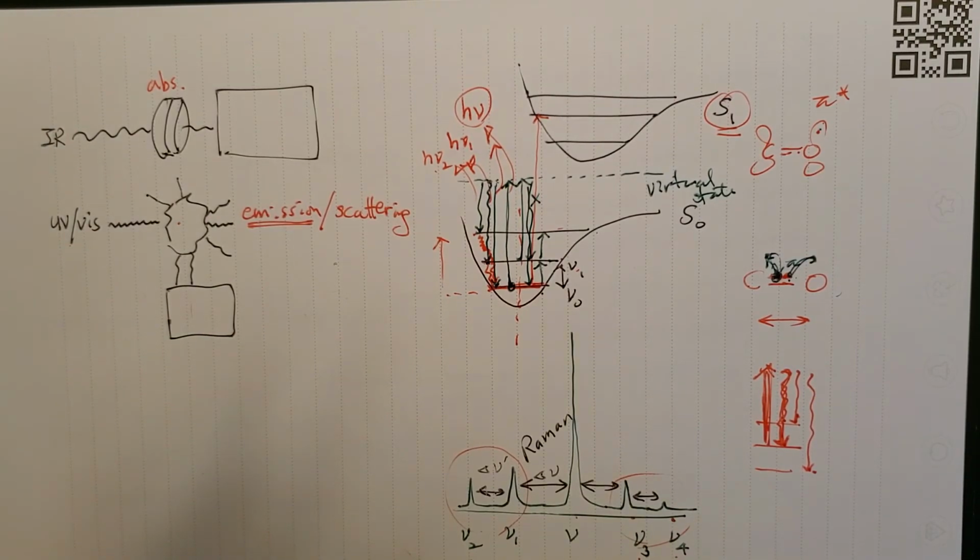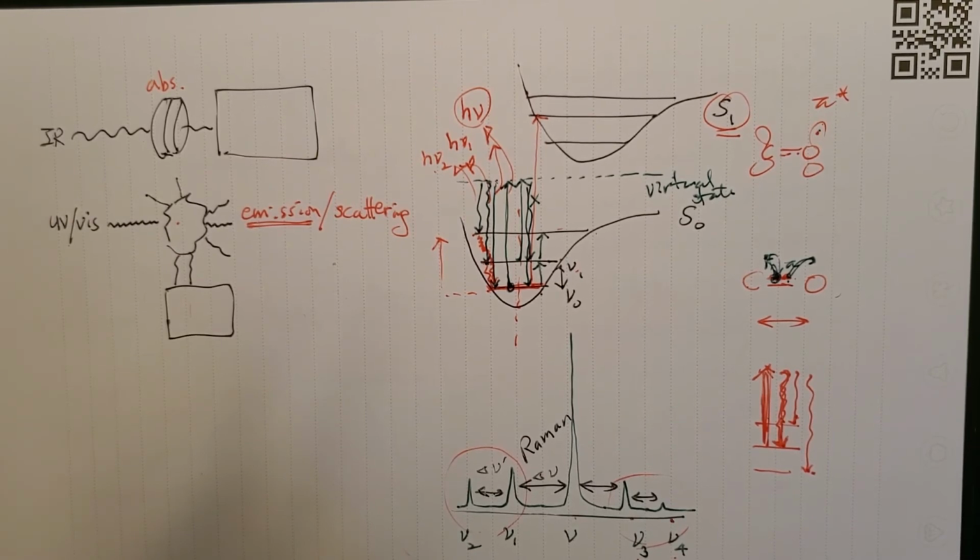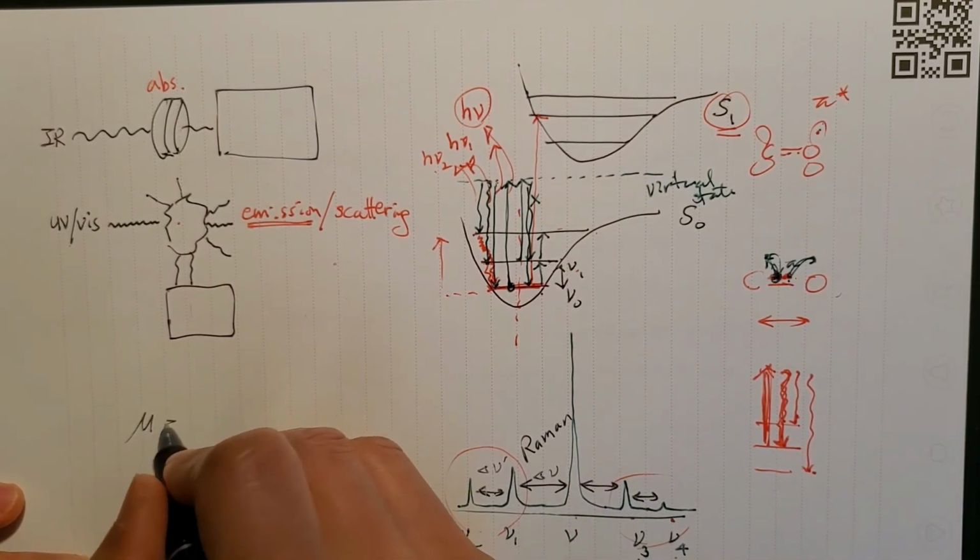But because of that, you know that the photon is not interacting with the dipole. So you can get away from this dipole-related phenomenon that's happening in the IR spectrum. And as you know, the dipole moment is normally a vector expressed as x, y, or z, like this, right?